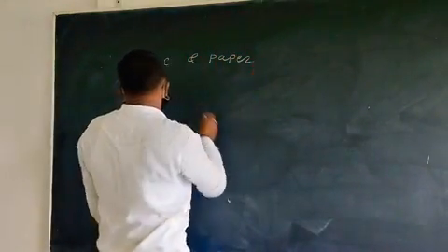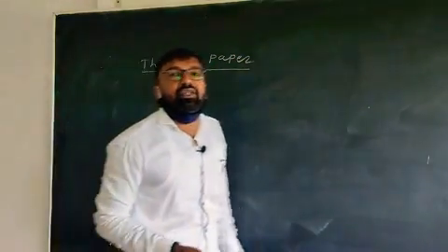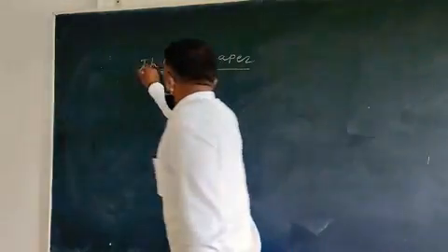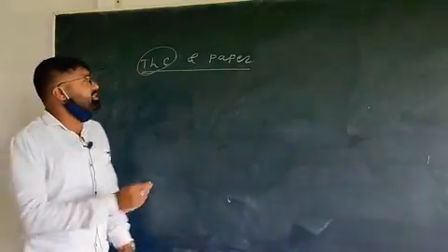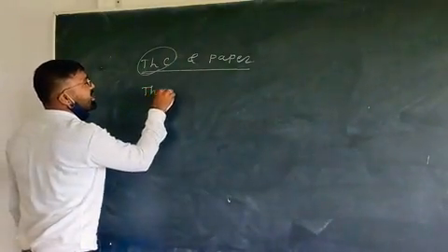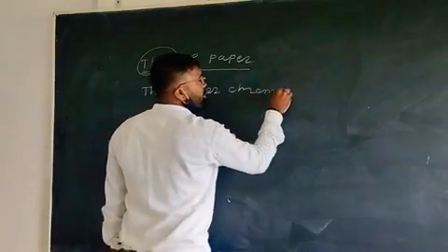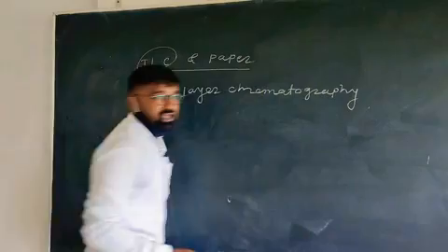Both are used by ourselves in the laboratory during practicals, right? First, I would like to discuss TLC, okay. What is TLC? TLC means thin layer chromatography, right? What is thin layer chromatography?